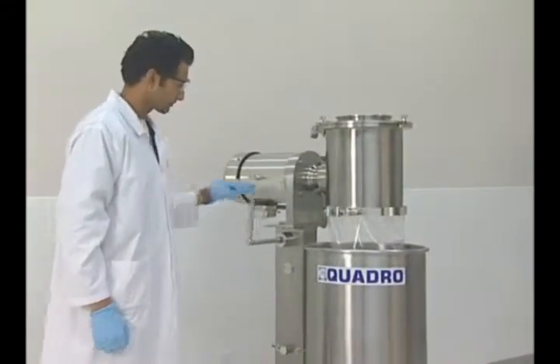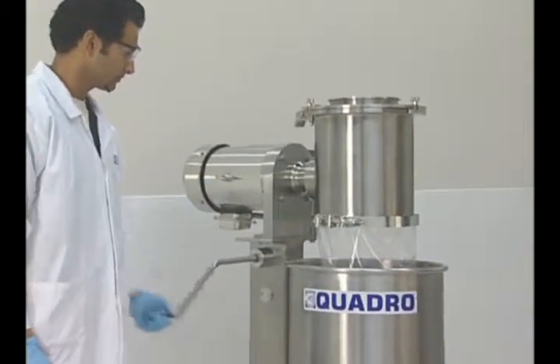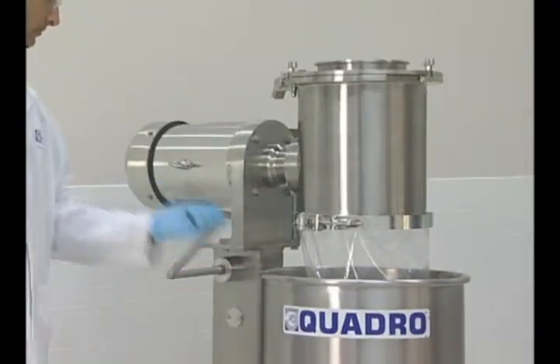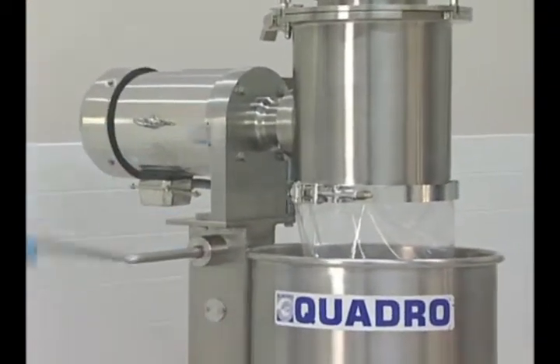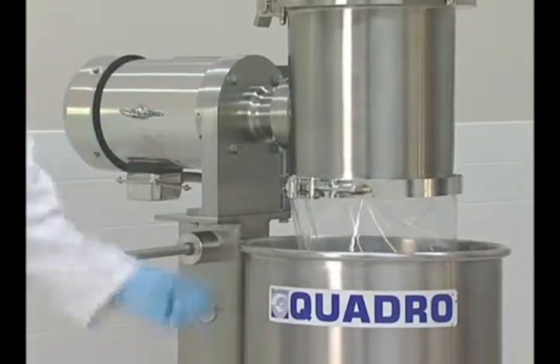The sifter is also available with a variety of features, including adjustable lift stands, clean-in-place, and autoclavable designs to handle your most exacting cleaning demands.